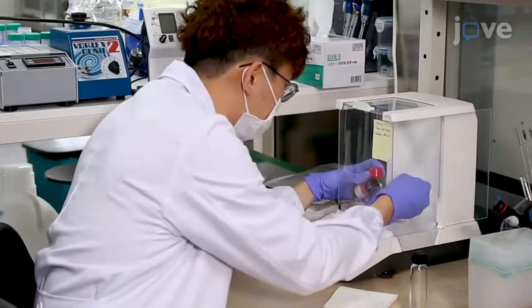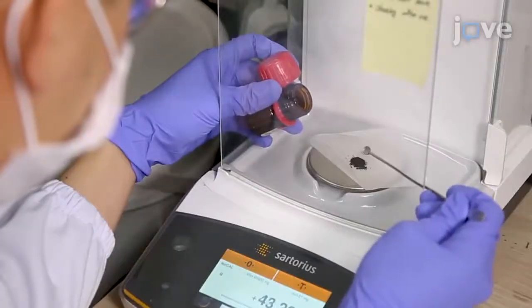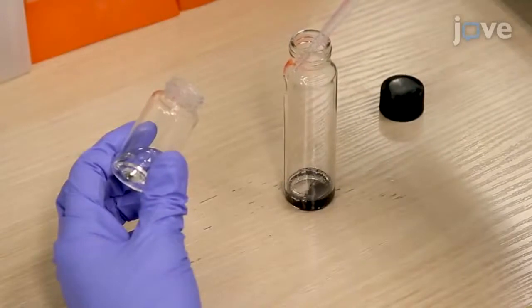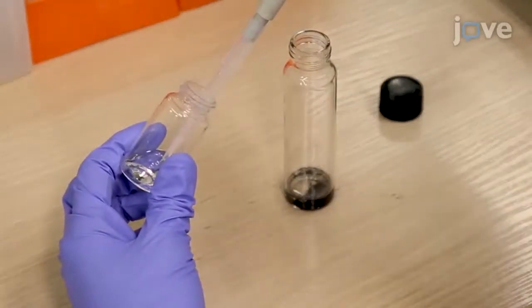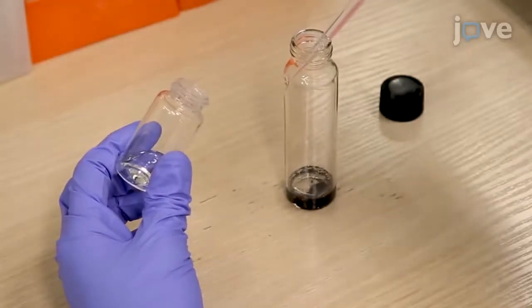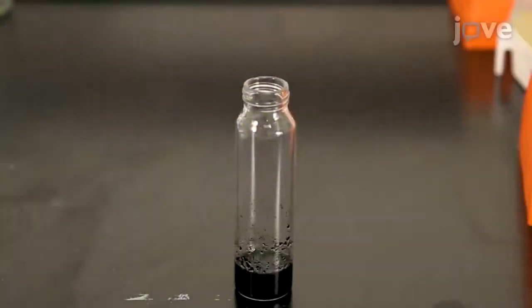To begin the procedure, place 30 to 50 milligrams of MWCNTs in a 50 milliliter vial. Using a micropipette fitted with 1 milliliter pipette tips, slowly add 8 milliliters of a 3 to 1 bivolume solution of sulfuric acid and nitric acid to the MWCNTs. Wait 30 minutes for the exothermic reaction to finish.